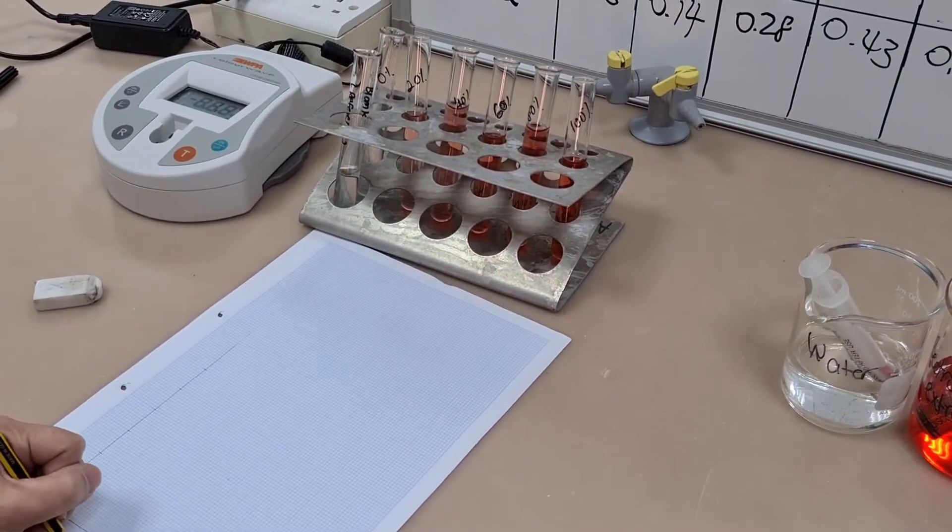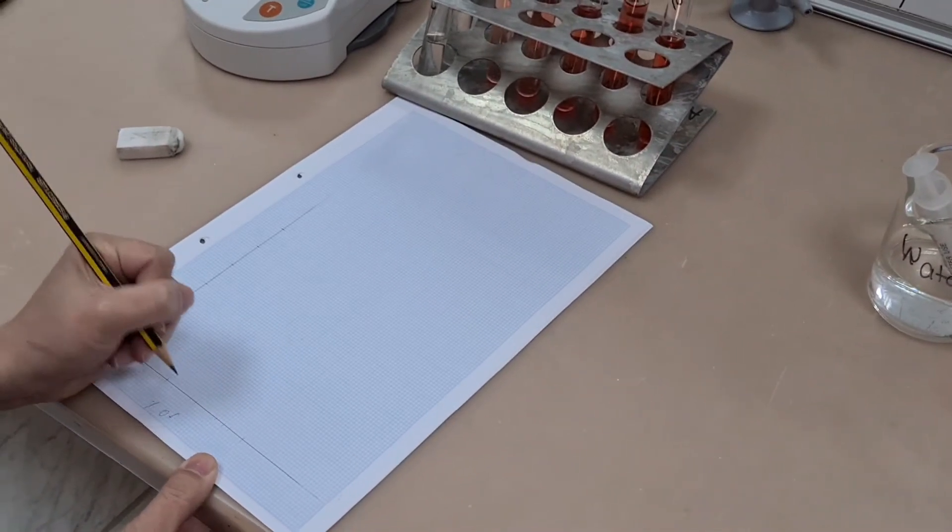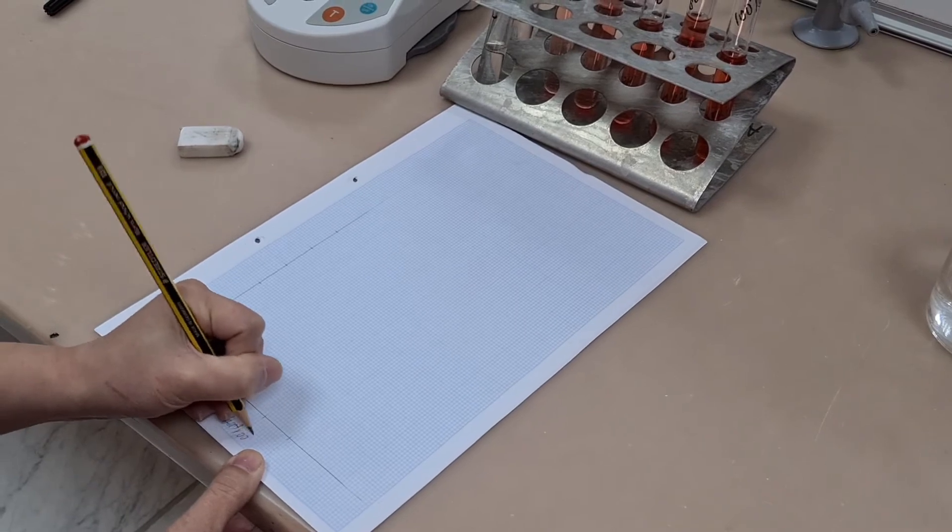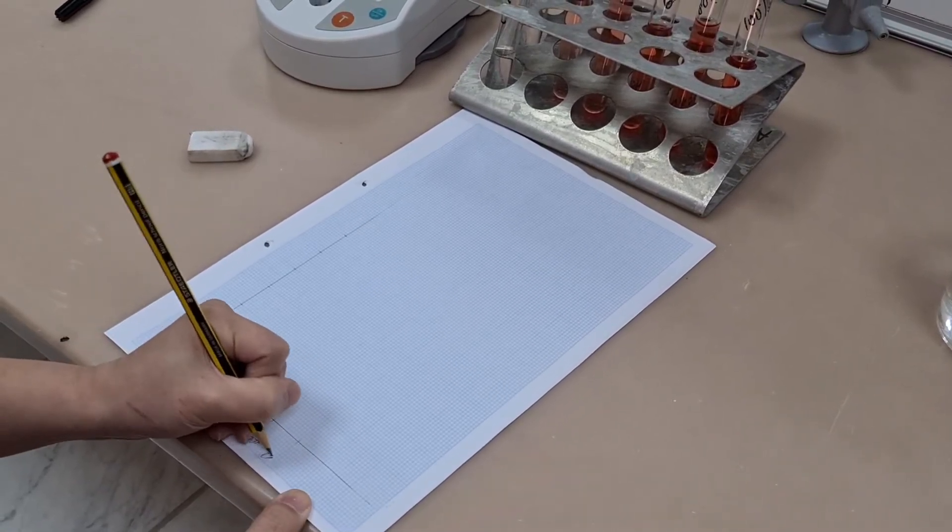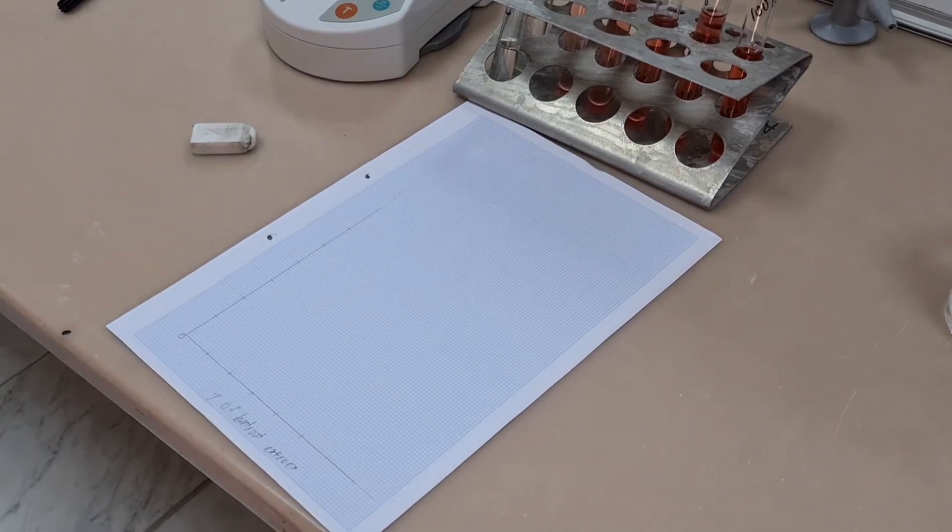So as we produce this graph let's just talk about the whole reason why you would do a calibration curve. You do a calibration curve with known concentrations and you plot it against either absorbance or transmittance. You produce a curve.